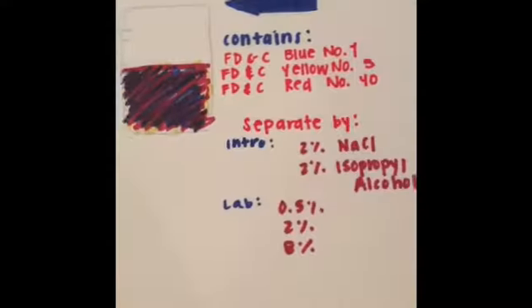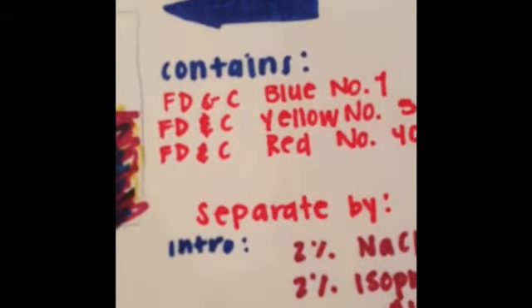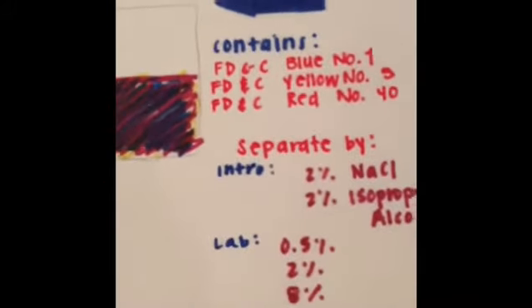We can further investigate the effect of the solvent concentration on the separation of food dyes. The results may be applied to study the connection between structure and mobility of the food dyes. So in this lab, we're going to start with a mixture of 3 different dyes. These are the dyes that are in the mixture, and our aim is to separate them all out.